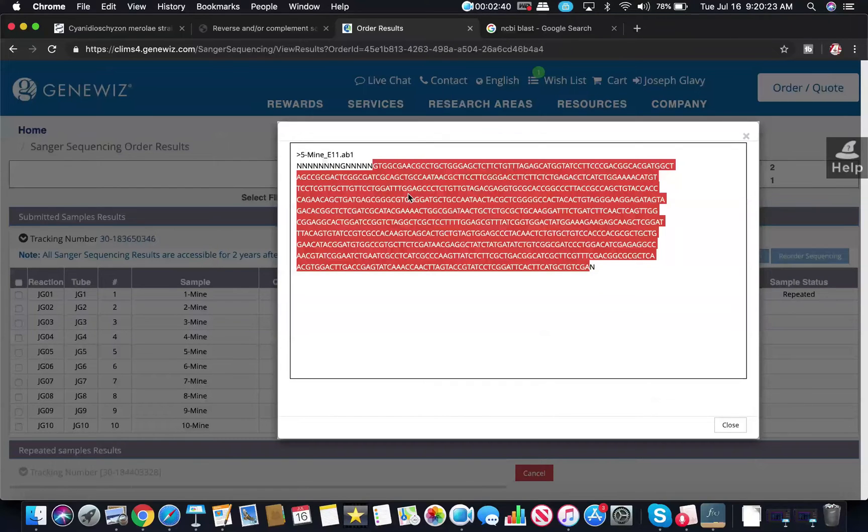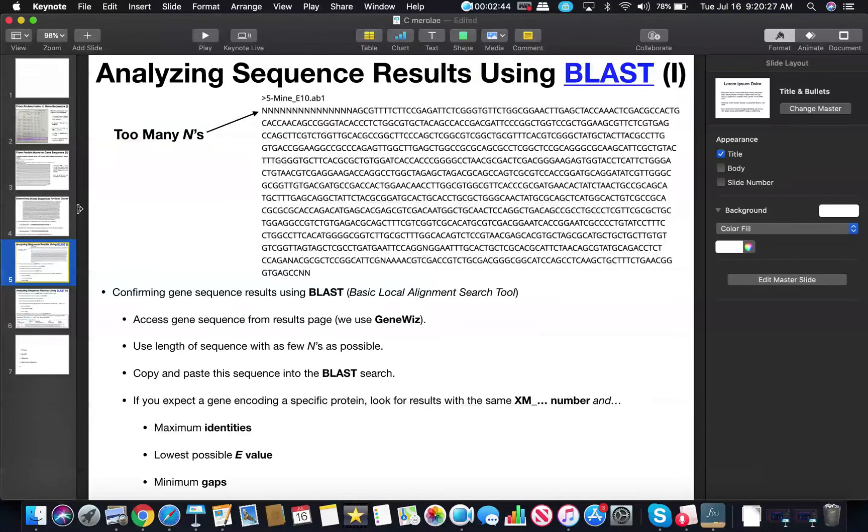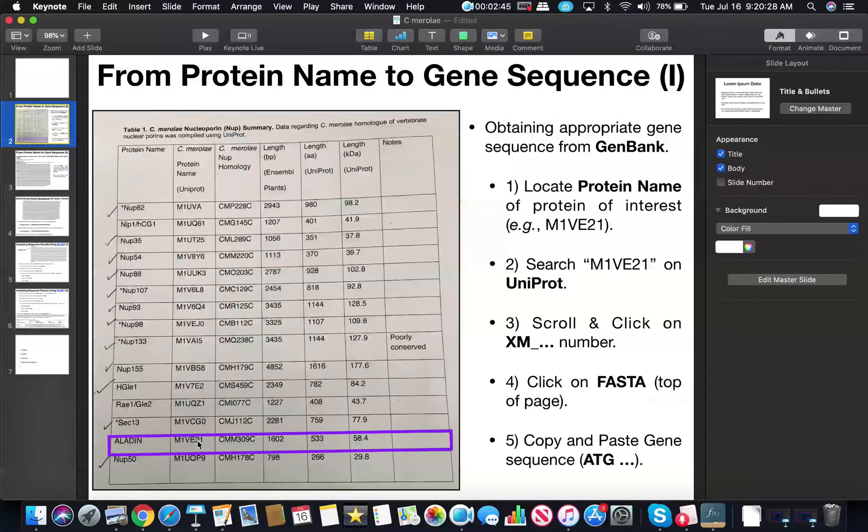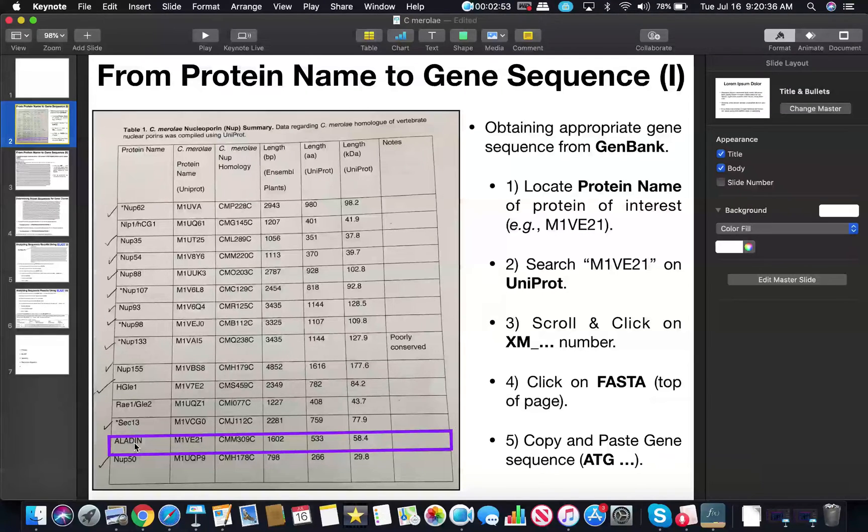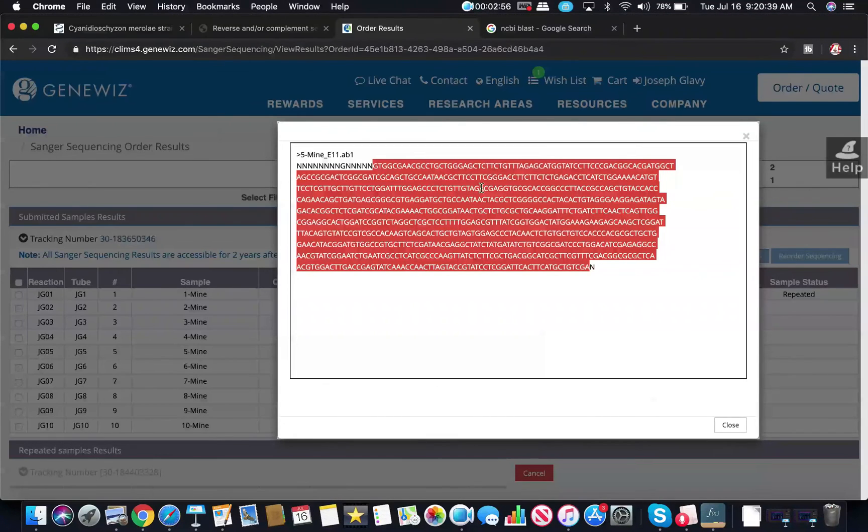Now just for the sake of the example that I've been using in the previous videos, I'm going to use the Aladdin protein. So I have a sequence that I've obtained that I think is from the Aladdin protein, but I want to verify that it is the gene encoding the Aladdin protein. So I get a sequence that looks something like this.